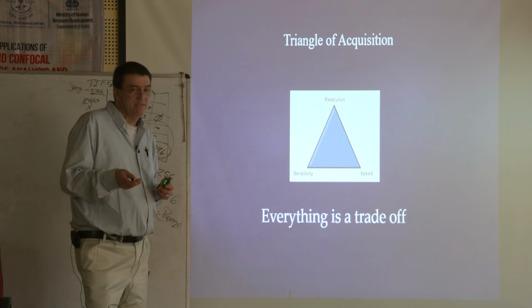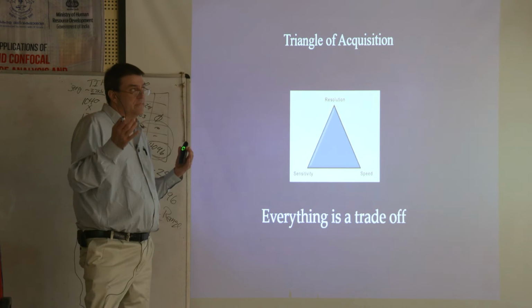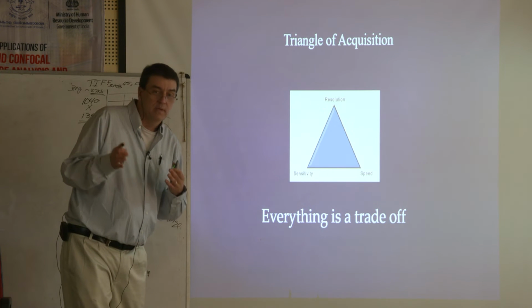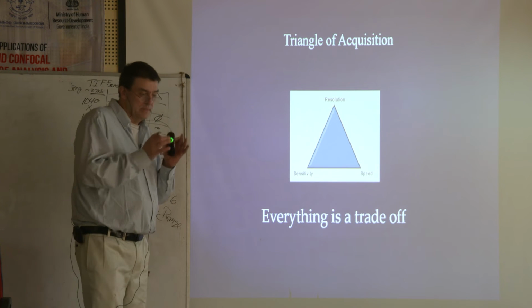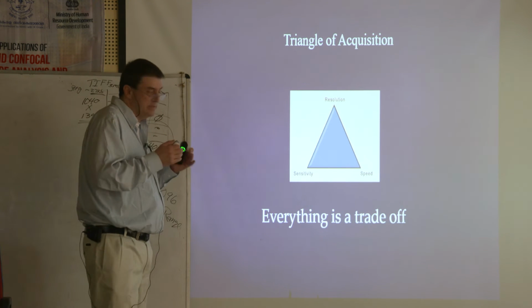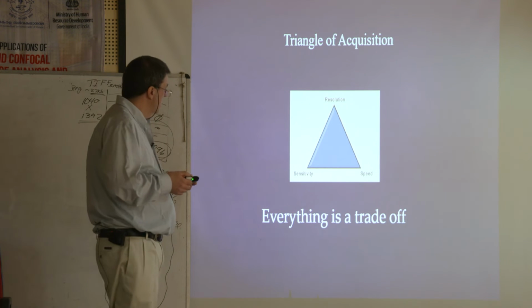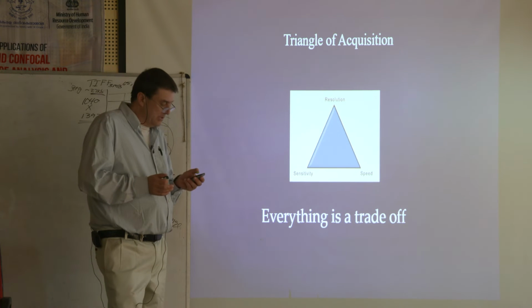So my advice to you is, if you start a lab and you know your main techniques, make sure you talk with the salesman and say, this is really what I need in terms of a camera, because I'm trying to do this. And they can steer you in the right direction. And like I said, always feel free to email me too, and I'll give you my advice. But all cameras are not created equal, and it's not all about a pretty picture.